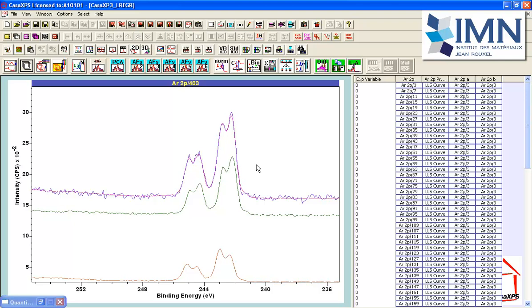So rather than immediately going for the obvious peak model, which was two pairs of doublets, I would think that it's more than possible that we have 3 or maybe 4 doublet peaks that we could use to analyze the data.